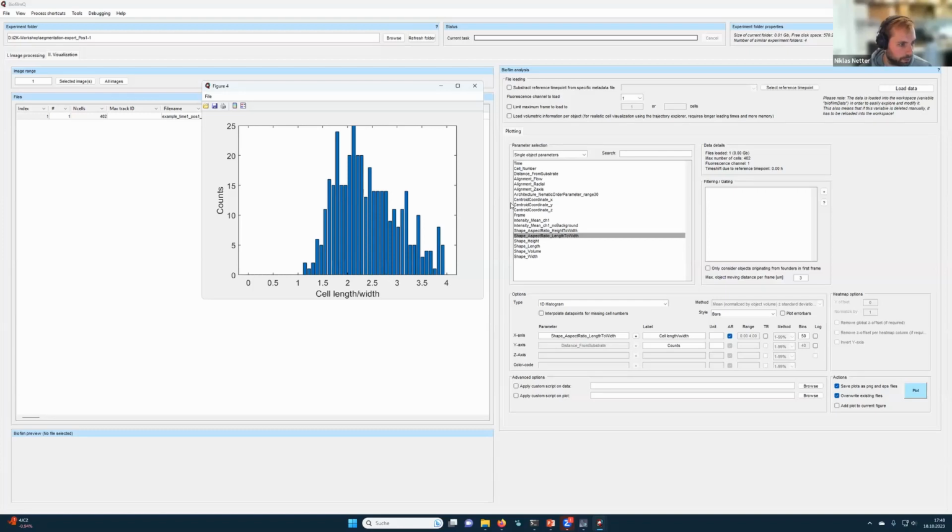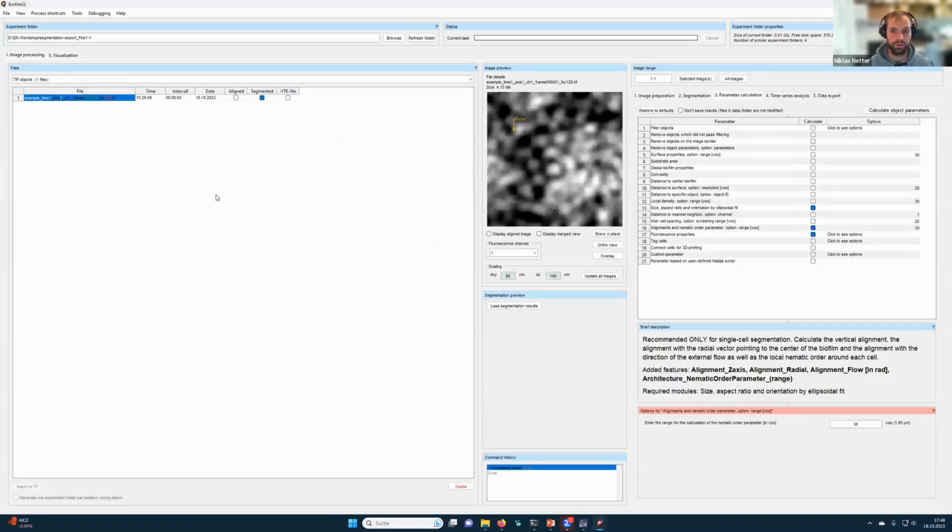Hi, Michelle. Thank you for your question. I will read the question. I have a general question. Is it possible to evaluate co-localizations of two different channels, two different proteins in BiofilmQ? So this would be a co-localization. I don't know if what I will show you now is really the perfect example for a co-localization measurement. But what you could do is having a segmentation of your cell and then go back and import two channels from a microscope and a third channel as your segmentation mask. So you would have 1, 2, and a third channel here.